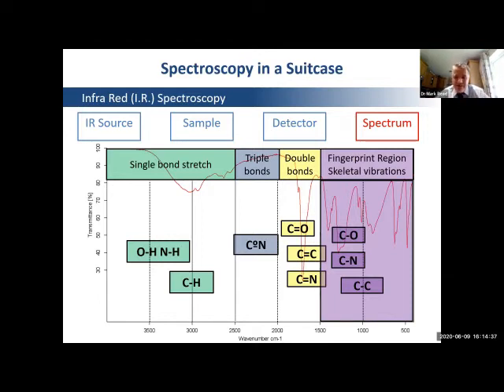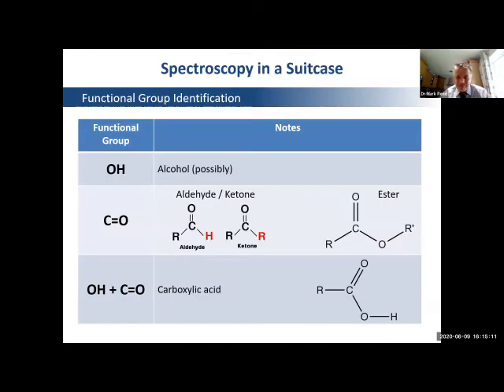However, it has come up in the A-level previously, what may this region be used for? And the answer is, although you can't get any uniquely identifiable peaks, if you compare the pattern with, say, a database or an online library, you can pattern match to identify your molecule. And we'll actually be doing this with an online database later. So for the purposes of the A-level syllabus, we avoid this region, but in practice and in forensics, this region is actually quite useful, and it has a lot of detail that the computer can use in a database to pattern match.